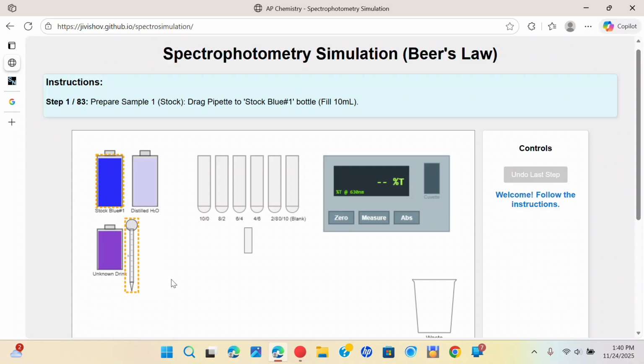Now, briefly, here's the idea of what will happen in this experiment. Using this blue stock solution, I will create a series of increasing dilutions of the stock solution in each succeeding tube, with the last tube, this one that says blank, as you go from left to right, being water in our case. That's going to be just the solvent only.